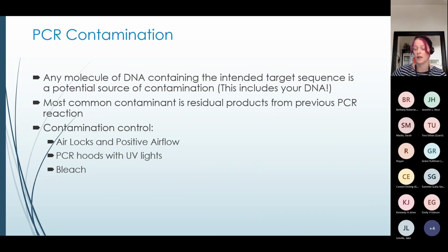spewing out everywhere. We do have a LightCycler that uses glass capillaries, and occasionally the glass capillaries break. In the next 2 years, though, it will be sunsetted, and we will hopefully get a whole new instrument that doesn't use glass capillaries anymore, and we will never have this problem, and it will be amazing. I cannot wait.